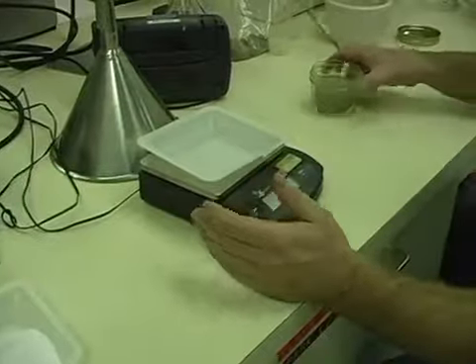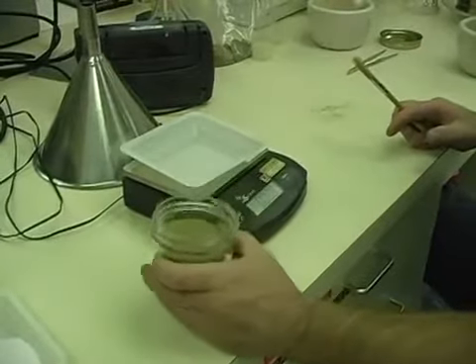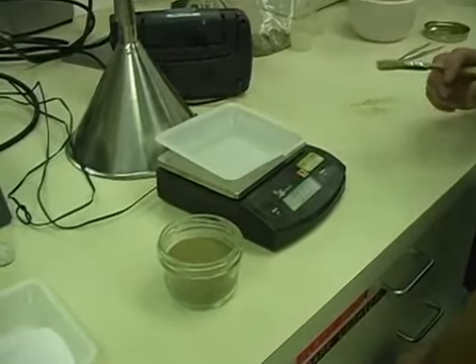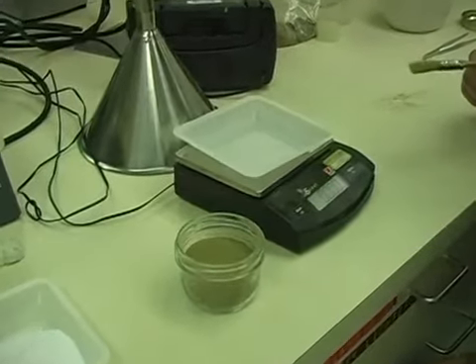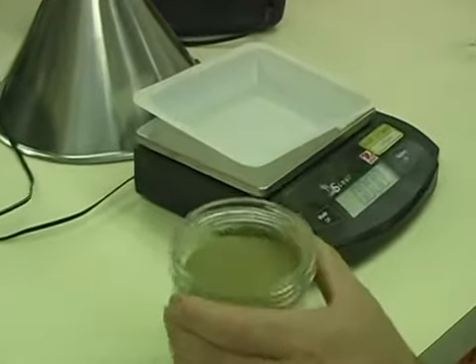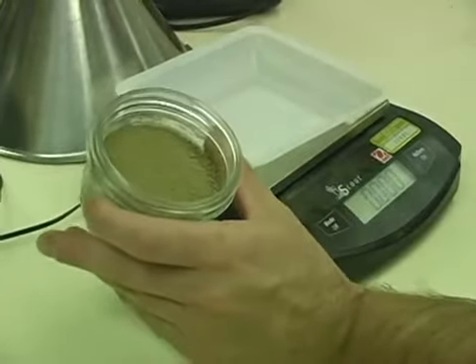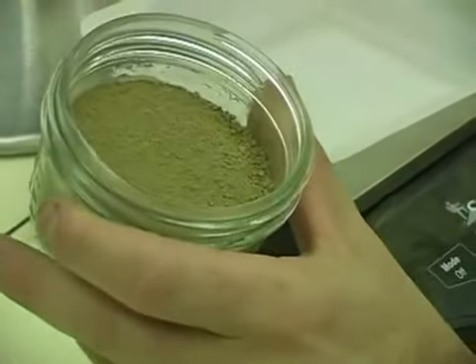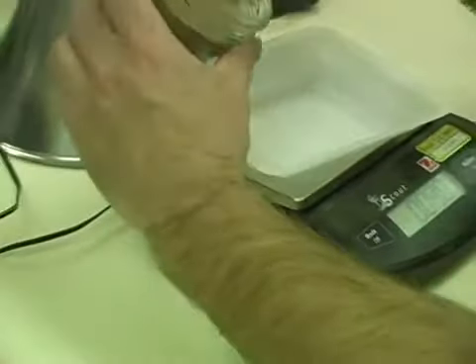those. And then we're going to take all the particles less than 2 millimeters, and for the texture analysis, you're going to be using anywhere from 50 to 100 grams of soil, depending on the sand and clay content. For this particular soil, it doesn't have very much sand in it at all, so we're going to be weighing out 50 grams of the soil.